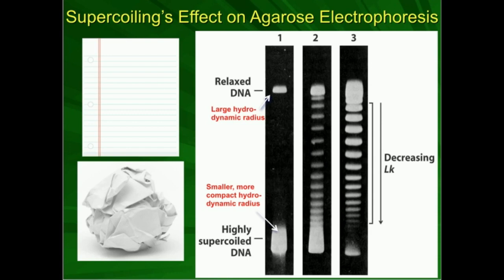What is topology? When you look at topology, you're saying, okay, I'm looking at this area of the land, it's flat. If I look at this area, its topology, it's a hill. This area is a mountain. Their topology is different. Now, when I talk about two DNA strands, identical in sequence, but with different three-dimensional structures due to different levels of supercoiling, we will call them topological isomers or topoisomers.